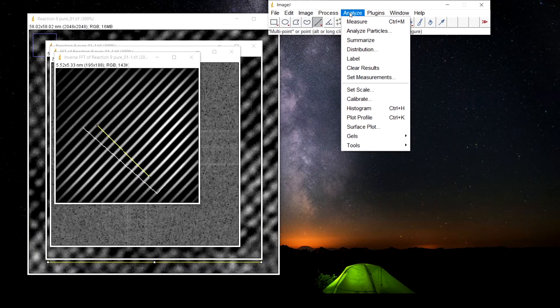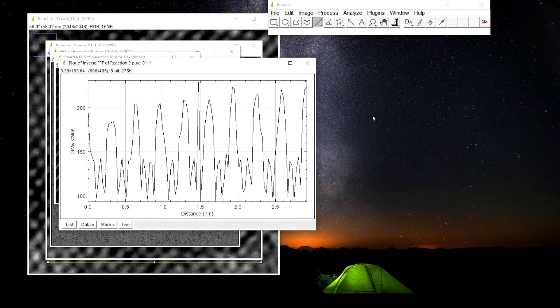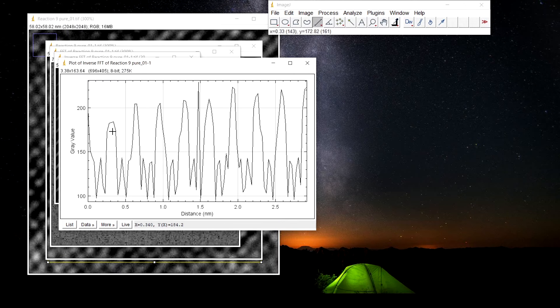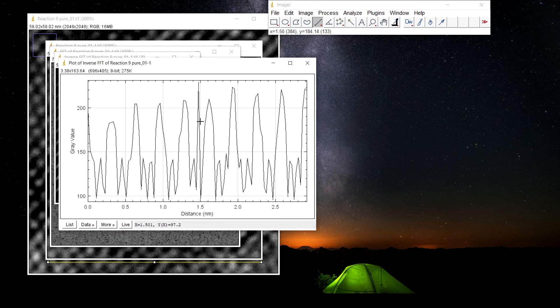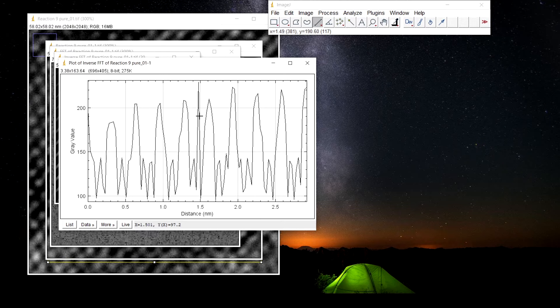Now go to analyze, plot profile. The number of peaks that we have is one, two, three, four, five, six, seven, eight. Here we have nine.